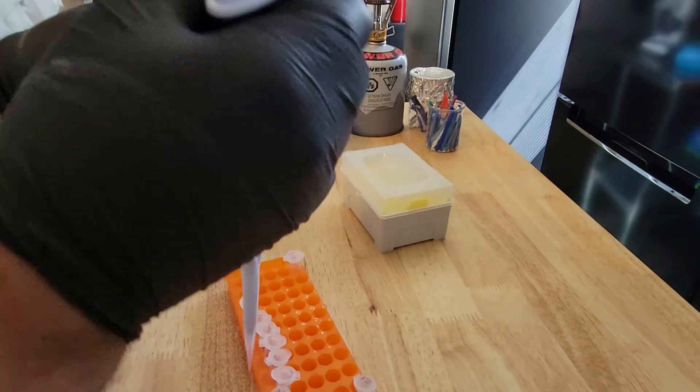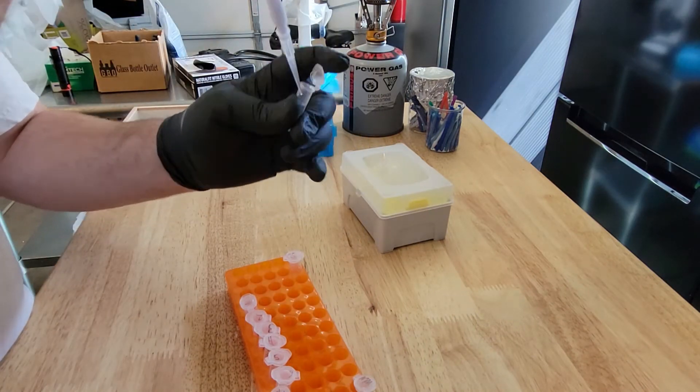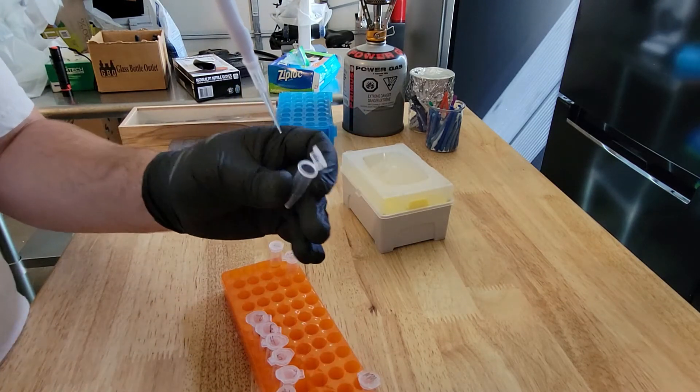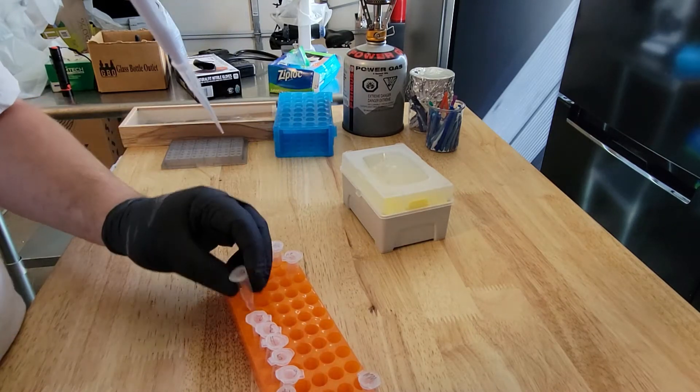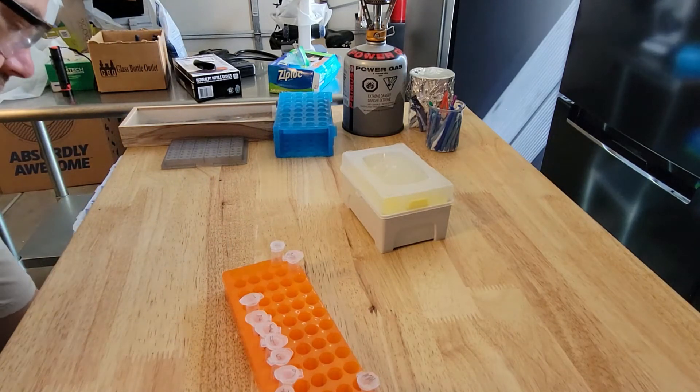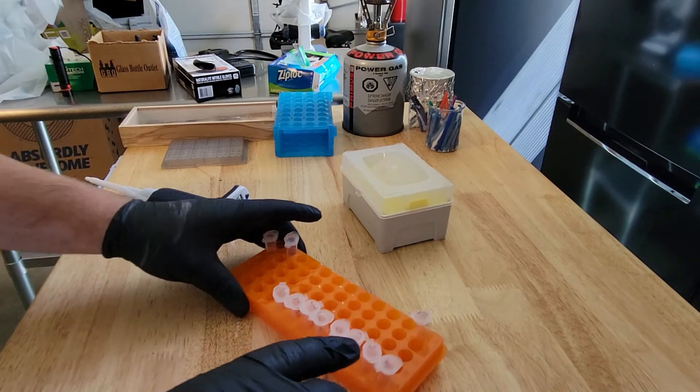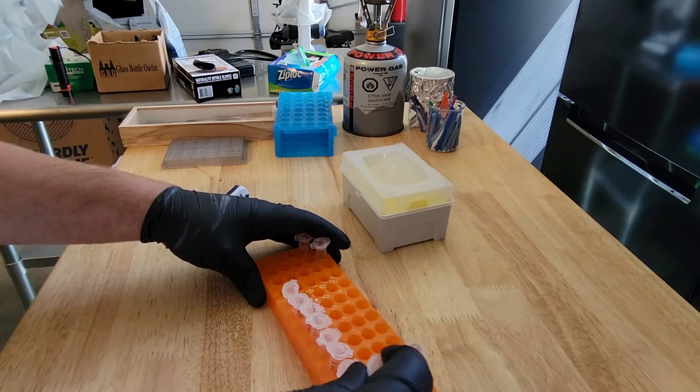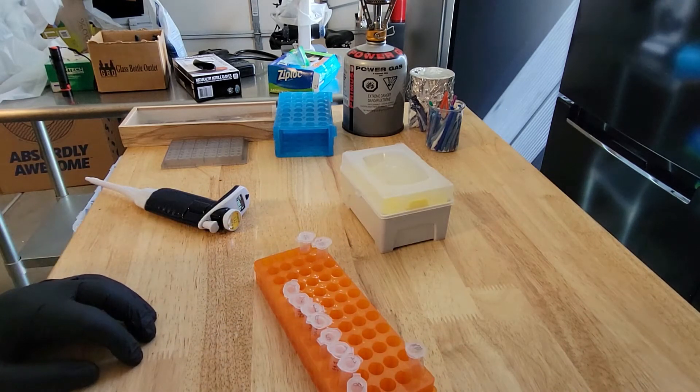100 microliters. I'm going to pipette that into the tube and do that for all the samples. I have seven of them. And then one, number eight, is going to be a negative control. So I'm not going to add any mushrooms to number eight, only the extraction buffer and other chemicals.